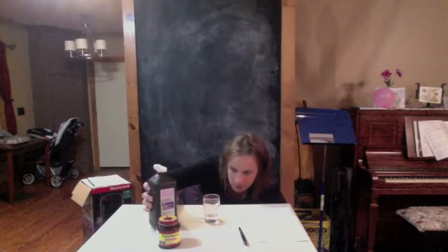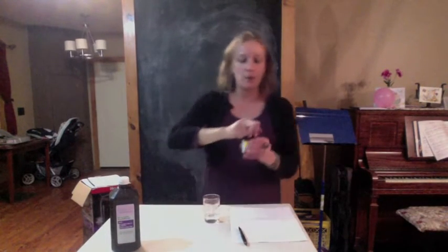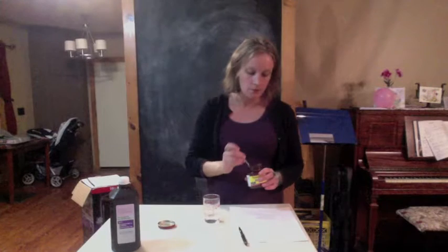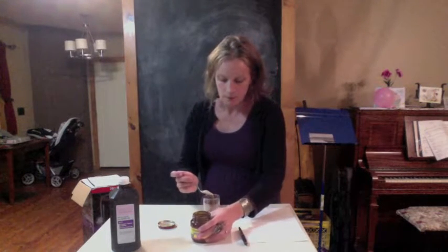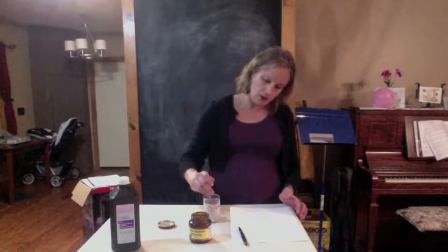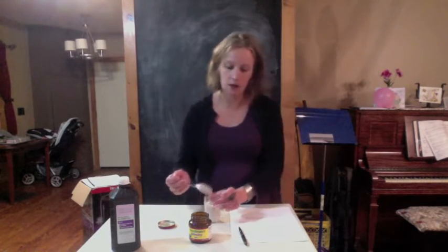So let's start with 30 milliliters of hydrogen peroxide. And we're going to open our yeast and just add about a teaspoon. Nothing's happening yet. If we mix it up, what do you see happening?